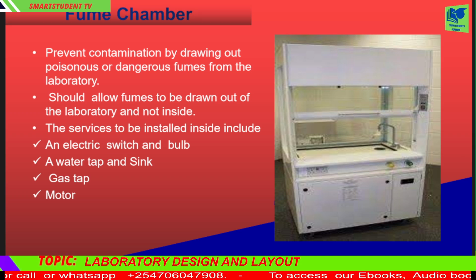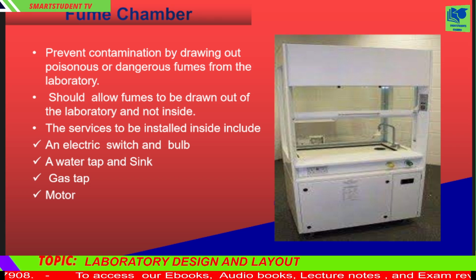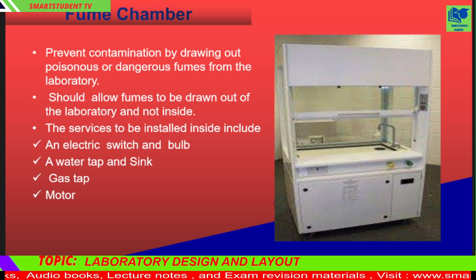How to use a fume chamber. Before using a fume chamber, it is important to ensure it is in good working condition. 1. Switch on the fan and adjust the vertical sliding glass to give a reasonable working space. 2. Place your reagents and substances accordingly and ensure that the reaction shall take place as required. 3. Close tightly, ensuring that no fumes escape out of the fume chamber. All fuming chemicals must be opened inside a fume chamber.